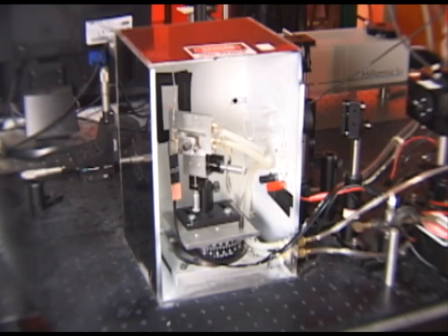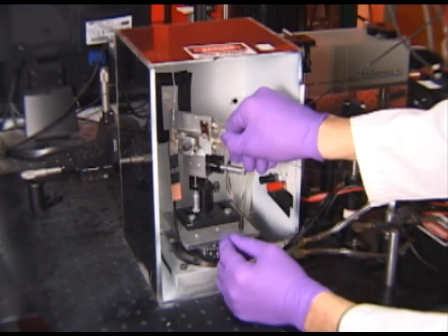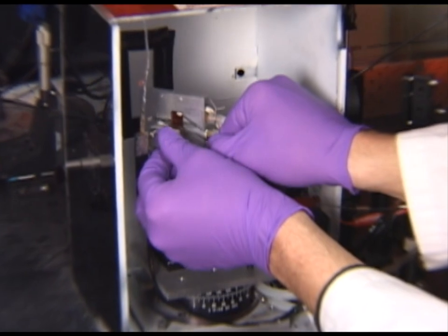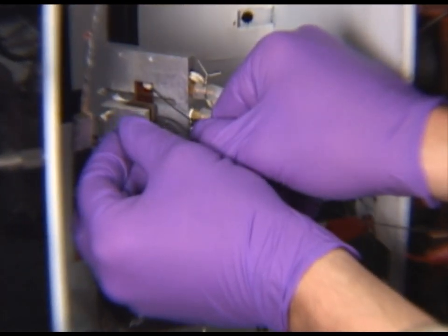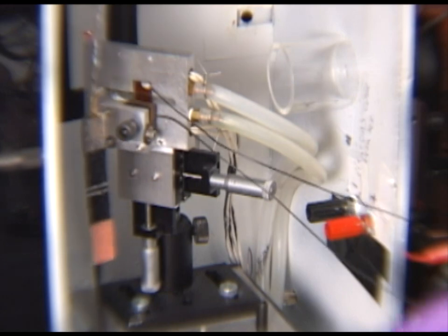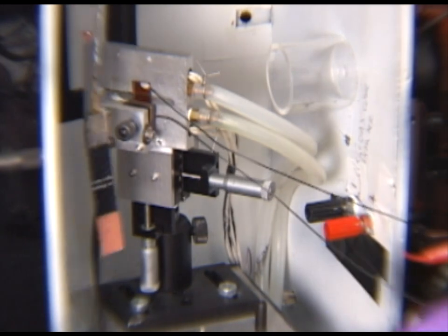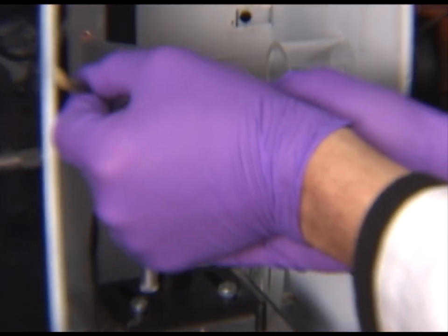Next we will affix a sample to the stage to begin poling and to measure the electro-optic coefficient. To do this we slide the sample into the stage and then tighten it to the stage with this screw. Once the sample is relatively tight we want to align the beam so that the light passes directly through the gold electrode at the top here. To do this we use this two-photon card which will allow us to see the infrared beam.